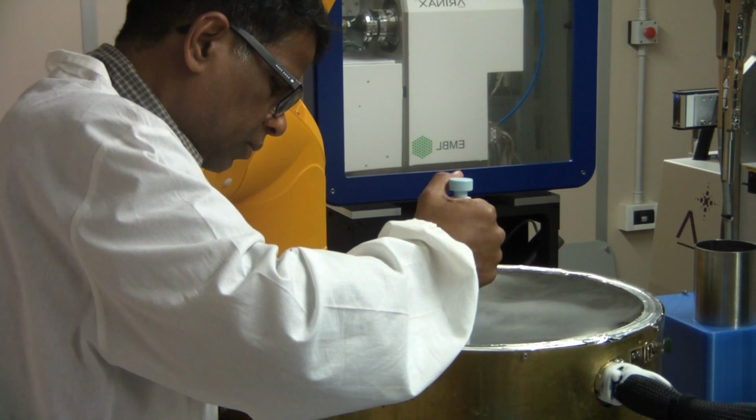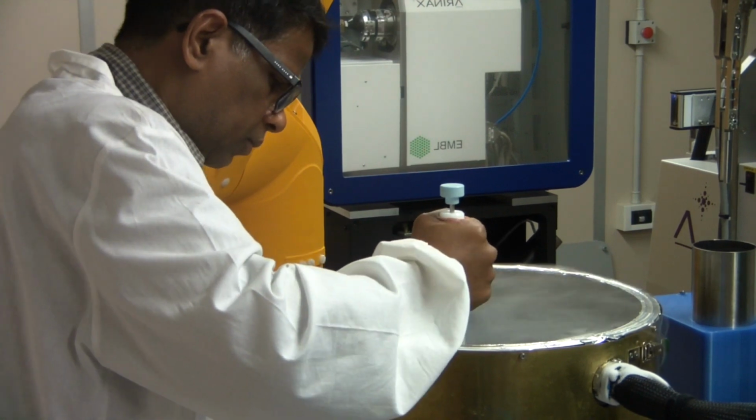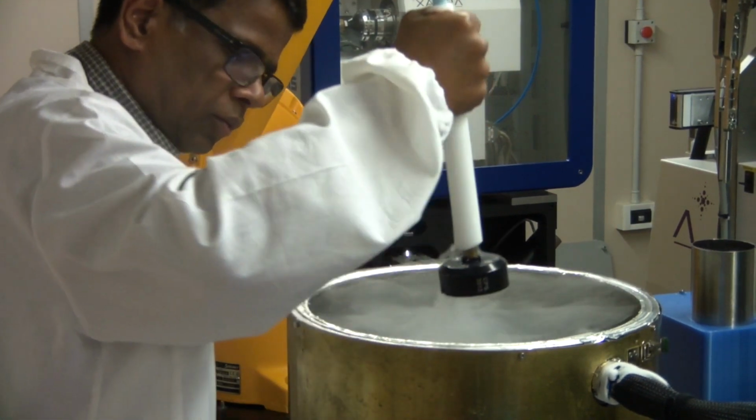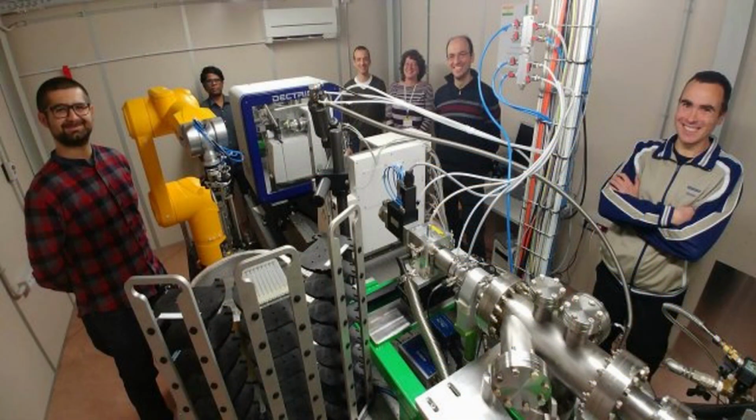Since this Beamline is a partnership with India, half of the beam time is dedicated to this very large community to come here. The rest of the beam time can be divided among anybody who requests beam time at this Beamline and goes through the process of getting their proposals scored. We have a very specific access mode here for protein crystallography: there is no deadline to submit your proposal, and monthly we review and allocate time for users.